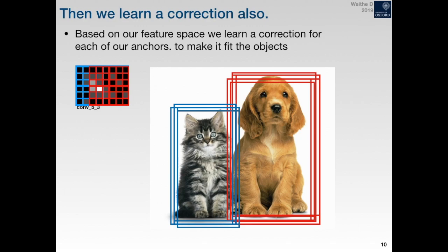At inference time, training can take a day or more, but once you've got it trained, it can evaluate what's in an image many times a second, and it can do it with great accuracy. The limitation, for such speed, is that it has to be a rectangular bounding box or a square, but not what we call a semantic segmentation, which is on the pixel level, because that's much slower.